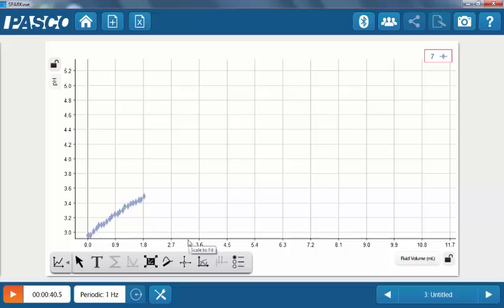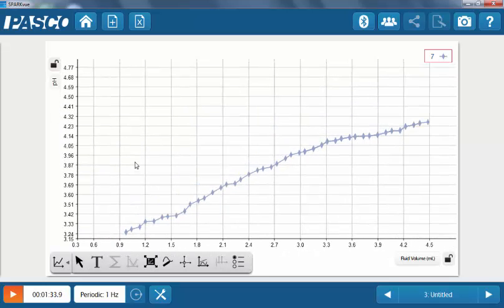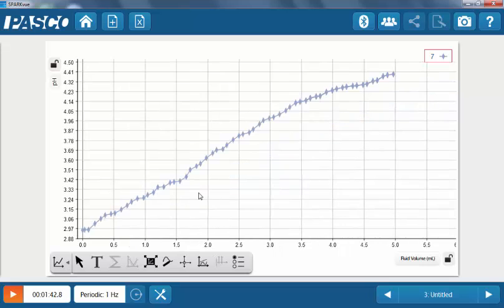Adjusting the top stopcock on a calibrated drop counter will decrease the accuracy of the calibration. The graph shows how pH is responding to the addition of titrant. In this case, the pH is increasing as titrant is added. Feel free to use the auto scale button or to manually adjust the axes during the titration. This will not affect the data that's recorded.